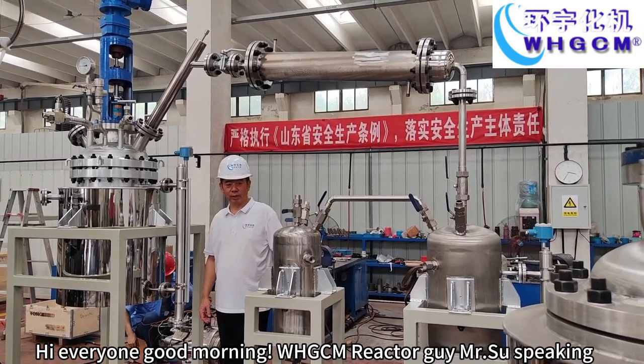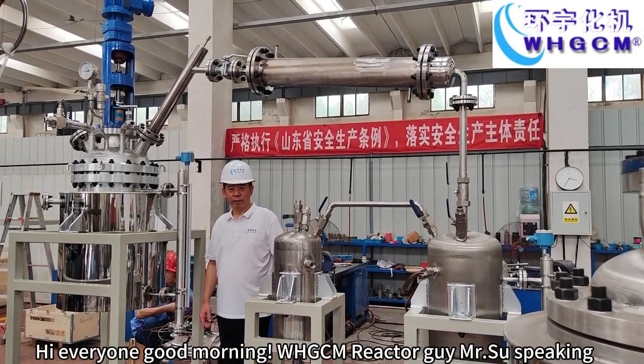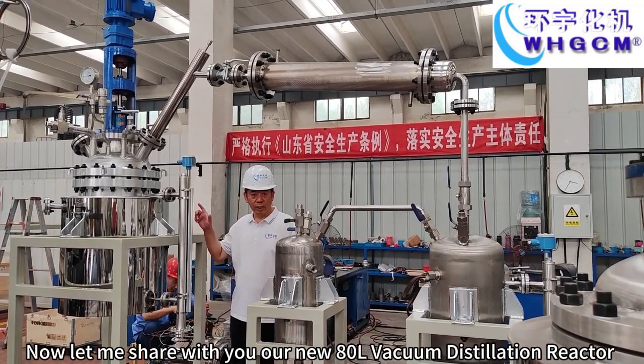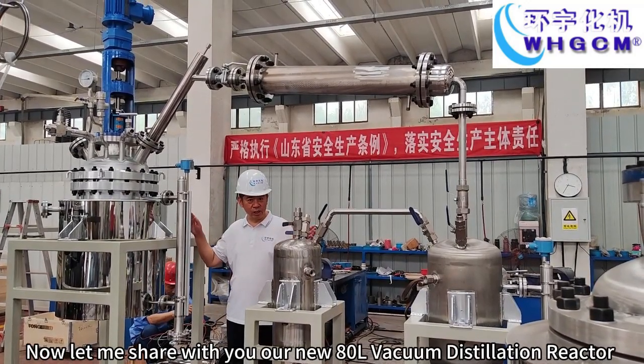Hi everyone, good morning. WHGCM Reactor Guy, Ms. Shu speaking. Now let me share with you our new 80-liter vacuum distillation reactor.